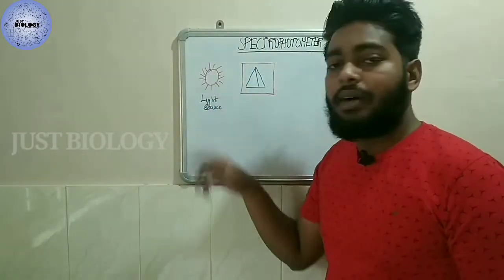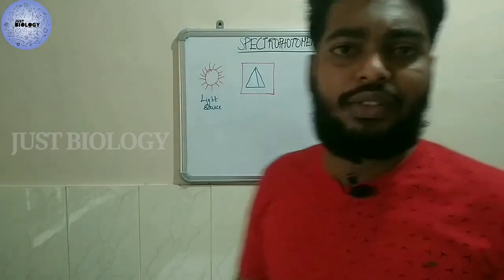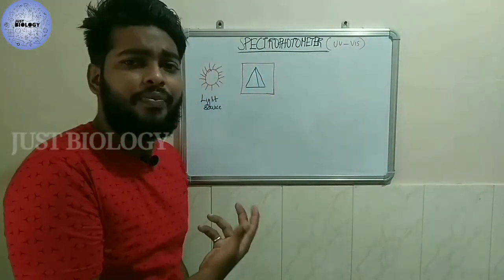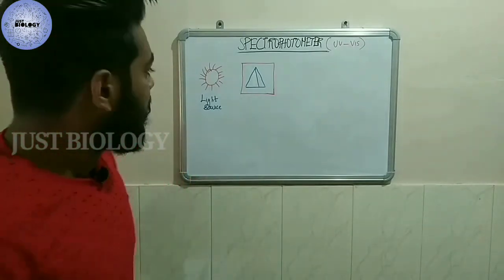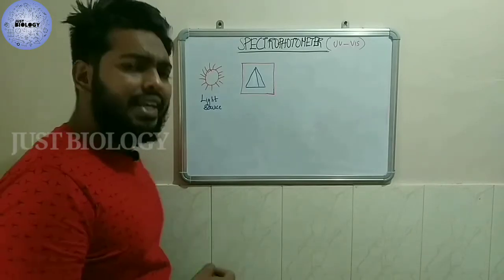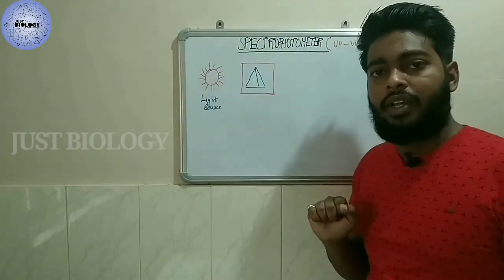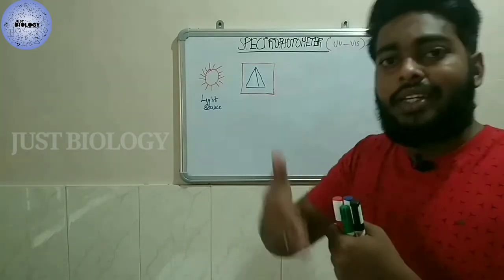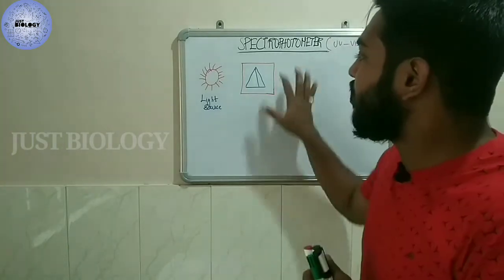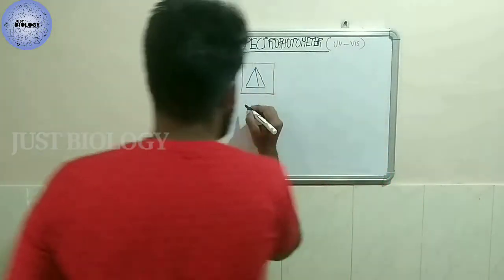Here you can see many lights which have different wavelengths, from 200 to like 800, I said. So we have to sort out all those lights. We need only a particular light which can pass through your sample. So other light should be prevented. That's why we use this monochromator with the prism. So here we have this monochromator.